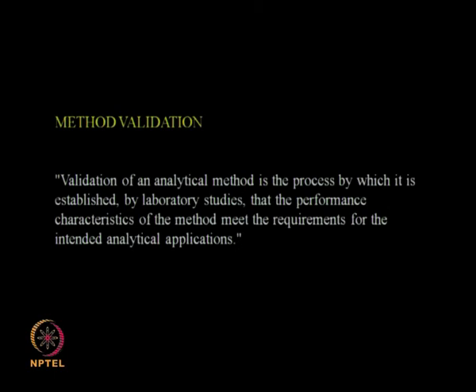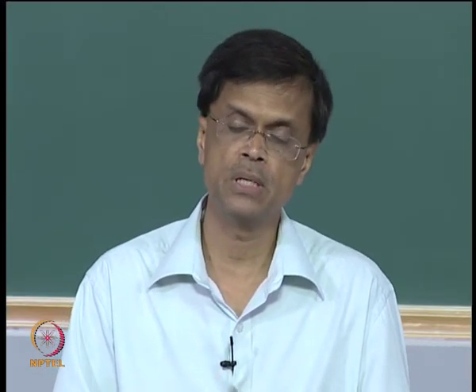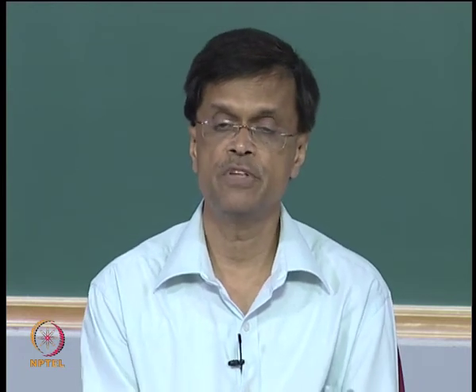Now in HPLC the most important thing is the method validation, because when you are developing a method you need to validate it totally and completely, especially if you are working on clinical trials. The FDA, that is the Food and Drug Administration, is very particular that whatever methods you develop are completely validated, and the method validation protocols, the results, the analysis have to be put with the papers when you are applying to the Food and Drug Administration for coming up with a new method.